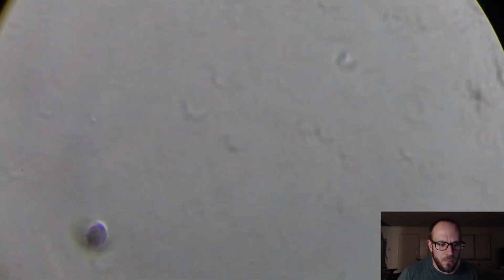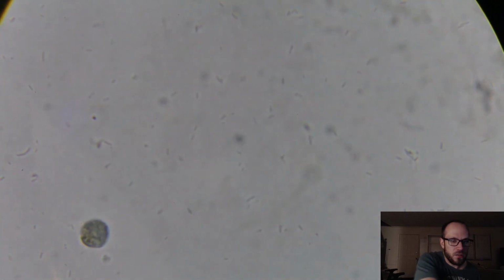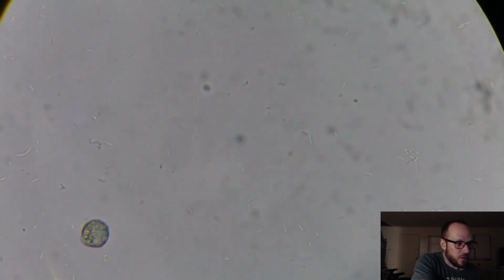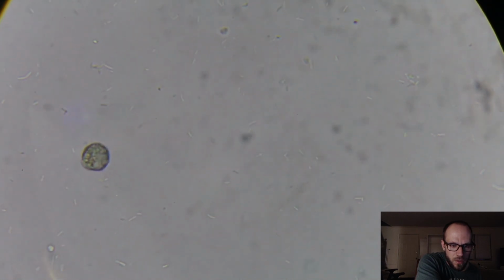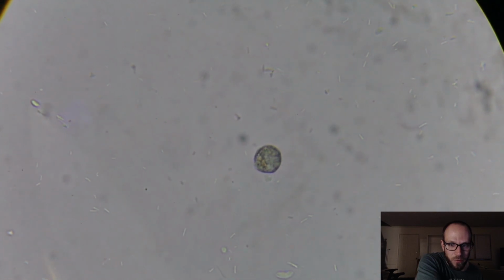I'm going to switch it to 400x, but seeing with 400x and having a filter like this is kind of difficult. So I'm just going to push the filter out of the way. And wow, dirty, dirty, dirty. I think I see bacteria. Oh, there we go. Yeah, very small. What are you? You look organic. Pretty sure I'm seeing bacteria everywhere all over this thing.